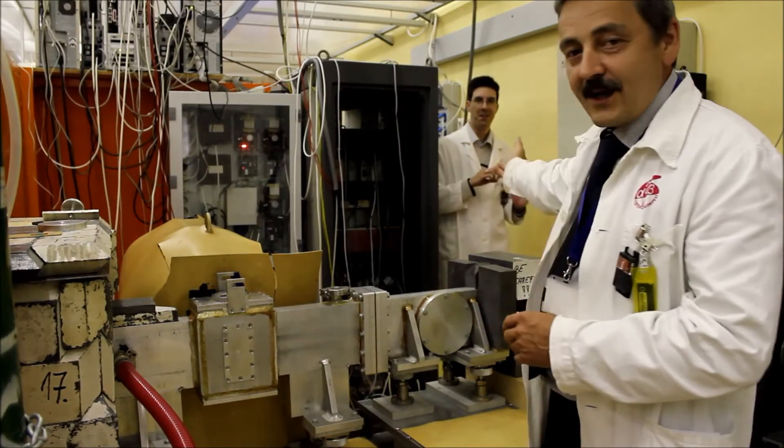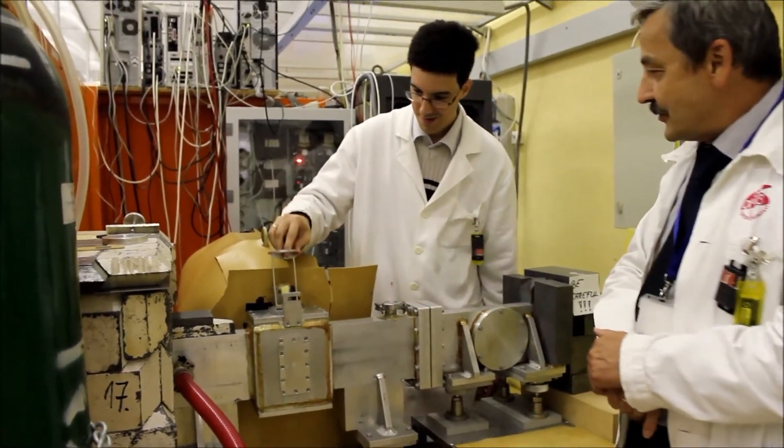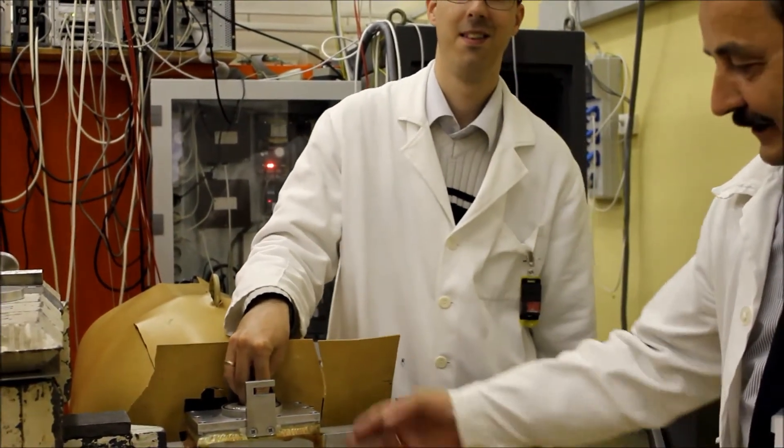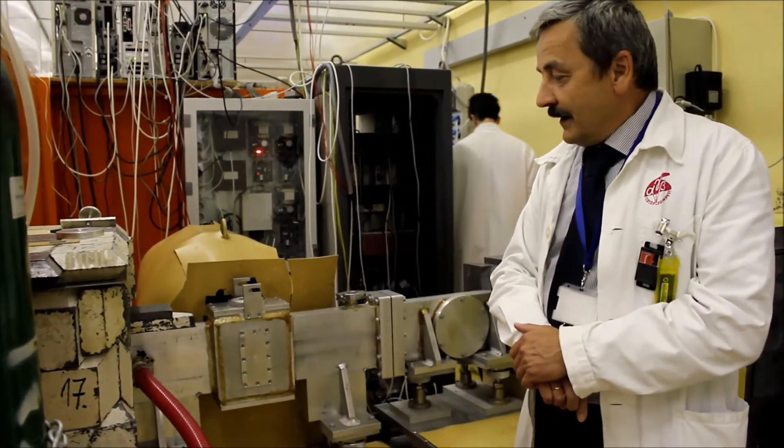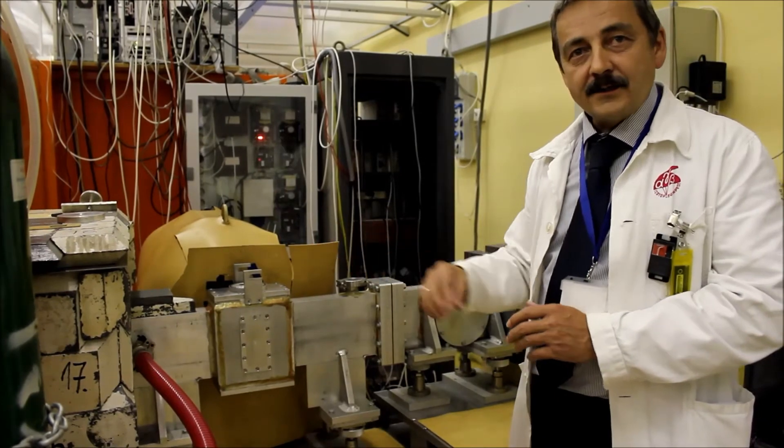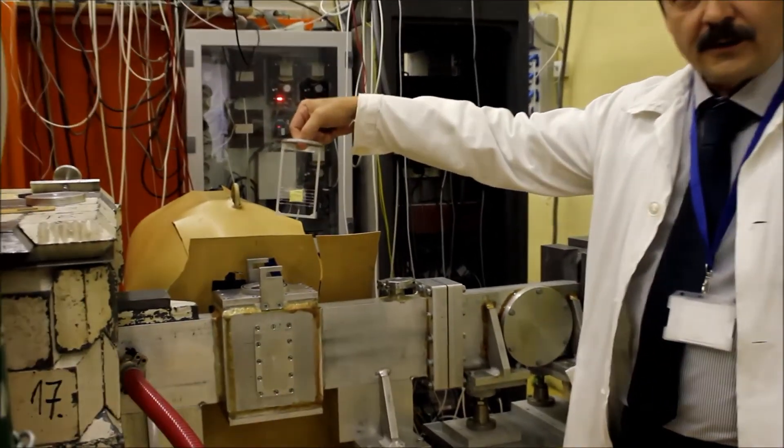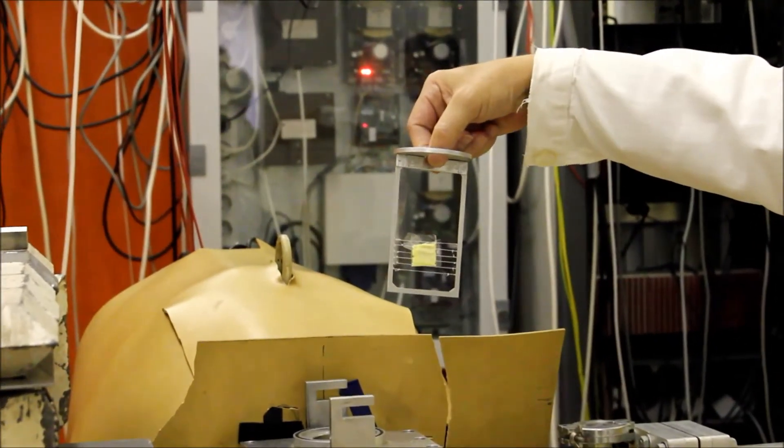So then here is a sample. Many times we are using powder samples. You can see how we can fit it into the sample chamber. The neutrons are irradiating the sample, which is about a tenth of a gram in reality.